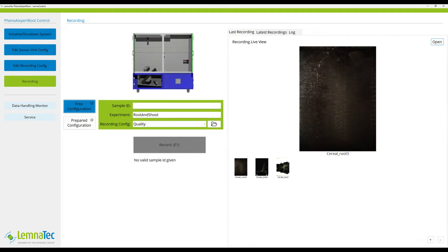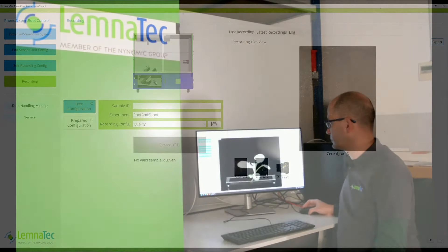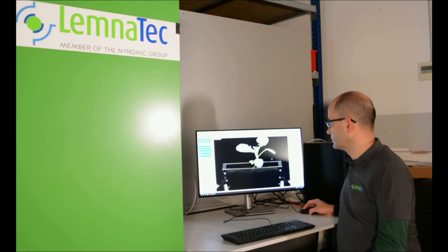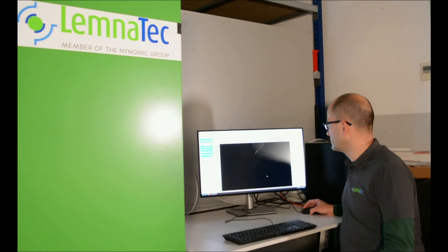To start image recording, select a stored recording configuration, enter an experiment name and a sample ID. When this is done, start the recording. Inside the cabinet, images of the shoot and root are taken and stored in the database.